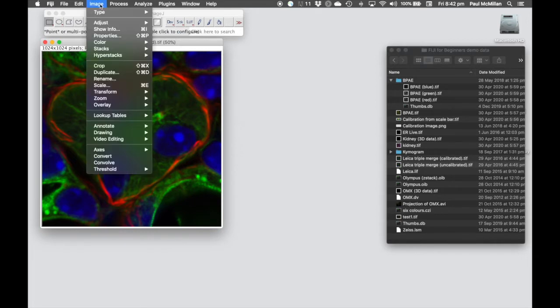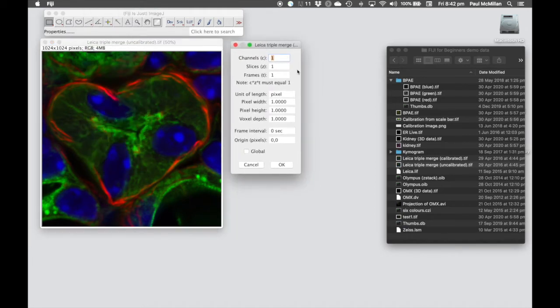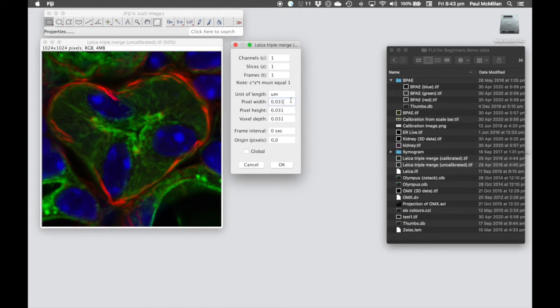We can modify this afterwards if we know the pixel dimensions. We go into Fiji Image Properties, or Ctrl-Shift-P, which tells us the properties of the image. Here we have one channel, one Z, one frame — an RGB image. Our current unit of length is in pixels. We can change this to UM, which Fiji recognizes as microns, and in this example we enter the value 0.031678.